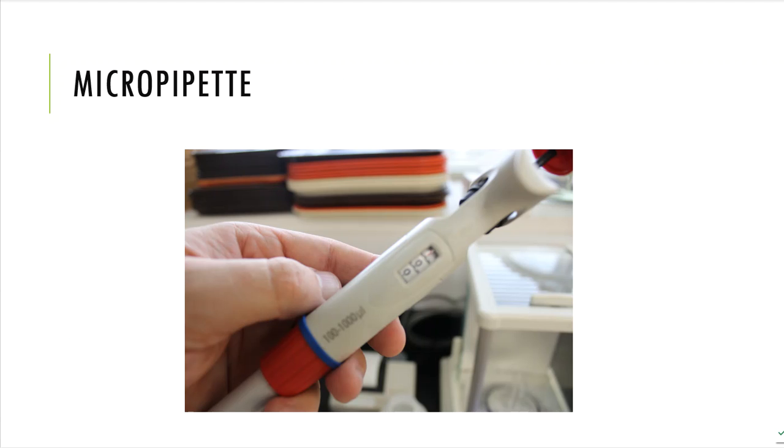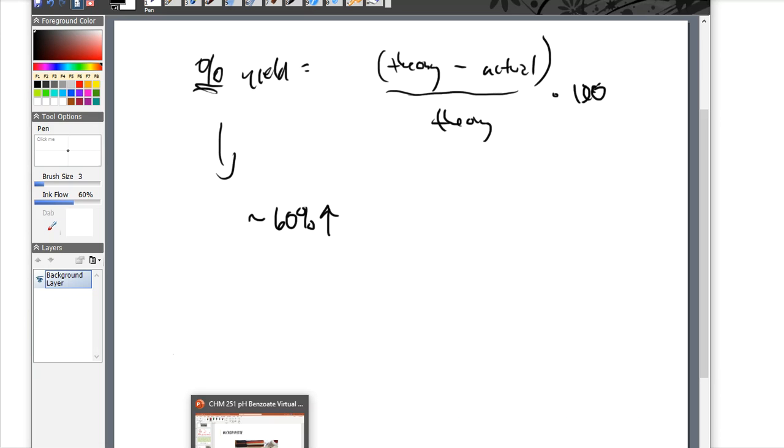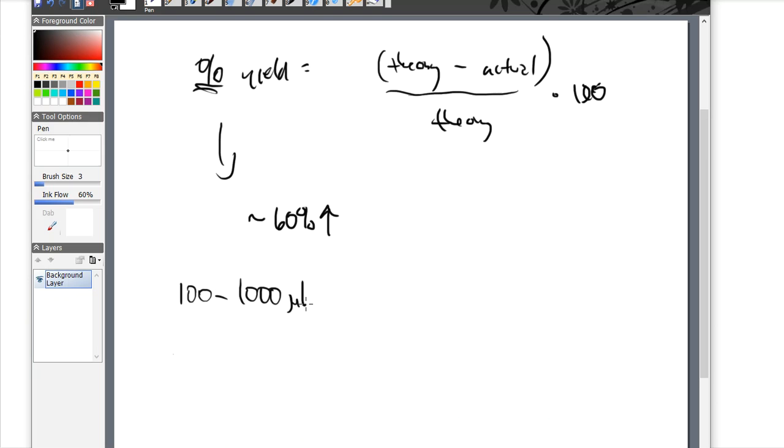All right, so this is a micropipetter, and on the front of the micropipetter, you see the stamp at which it is suited volume-wise. And it says 100 to 1,000 microliters. All right, so we've got to kind of hone in on that first. We got to feel comfortable with that. So 100 to 1,000 microliters. All right, that's not milliliter, people. That's microliter. Microliter and milliliter are related.